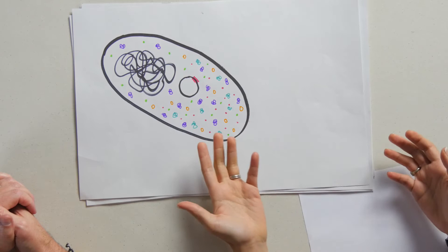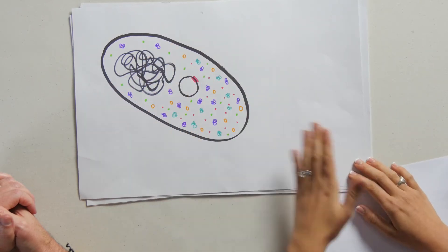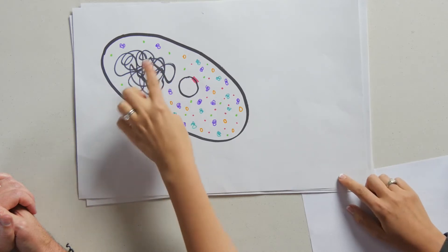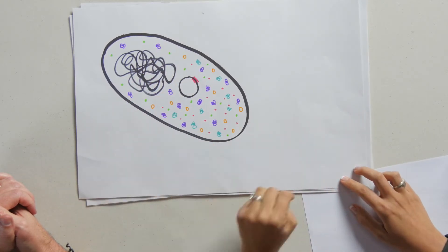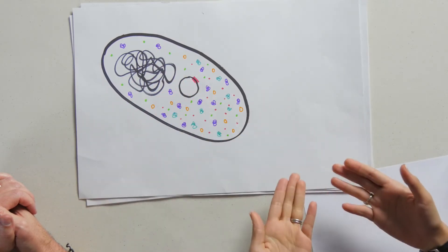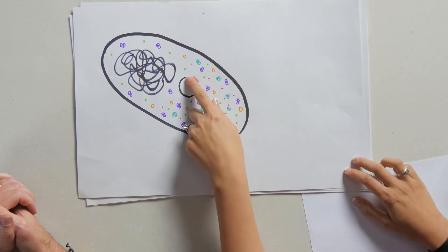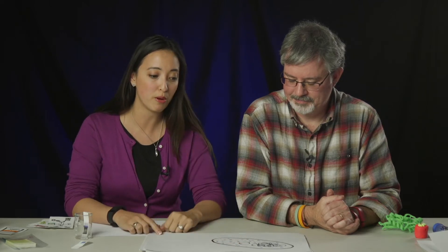Now, the things we want to sort aren't dyes necessarily. In this case, we actually have a whole bunch of cells making a protein for us. Now this is a picture of a bacteria cell. And our bacteria cell has stuff inside - there's DNA, the bacteria's own DNA. There's plasmids we've inserted that have genes that we want to produce particular proteins like our RFP, our red fluorescent protein.